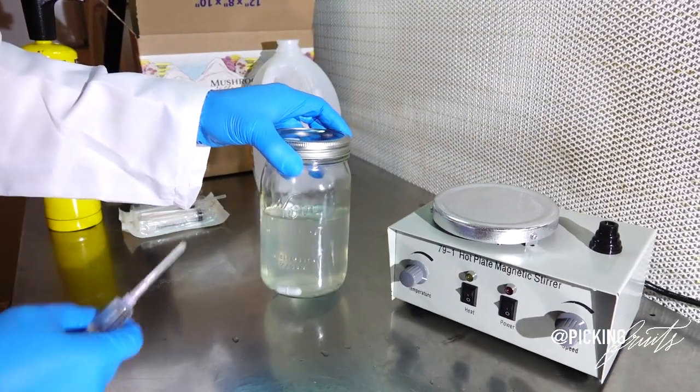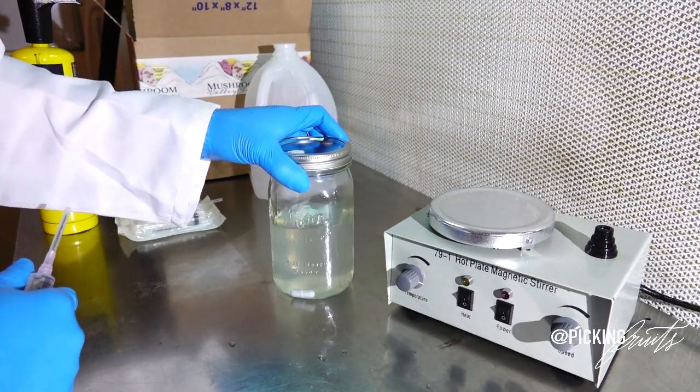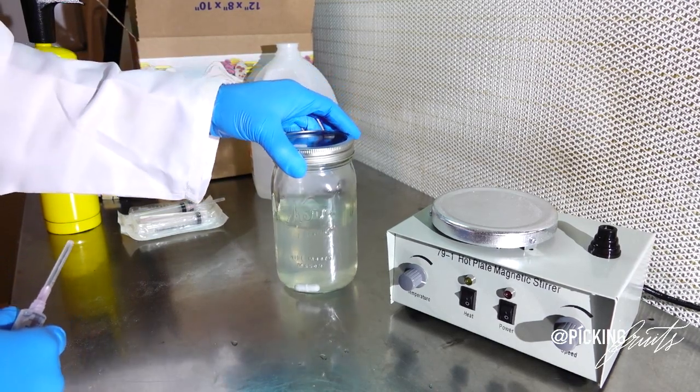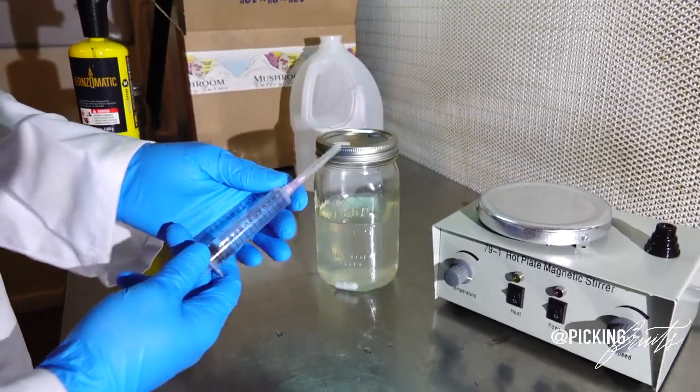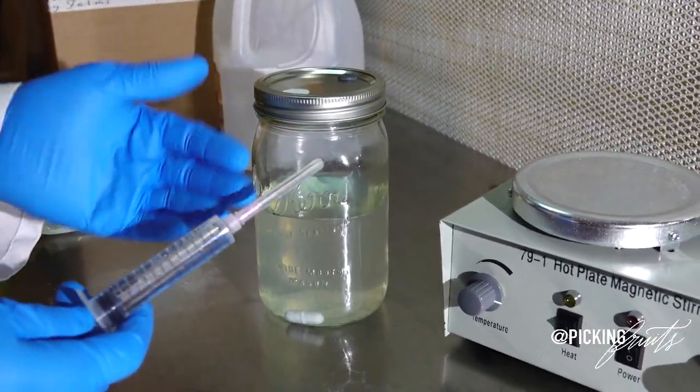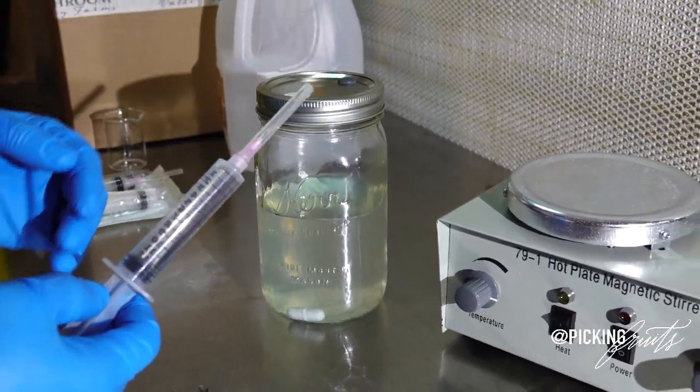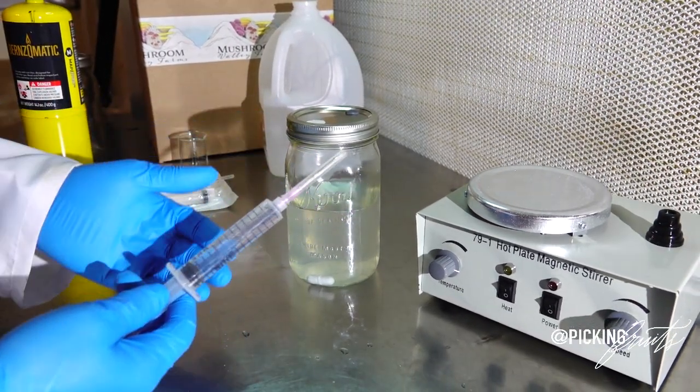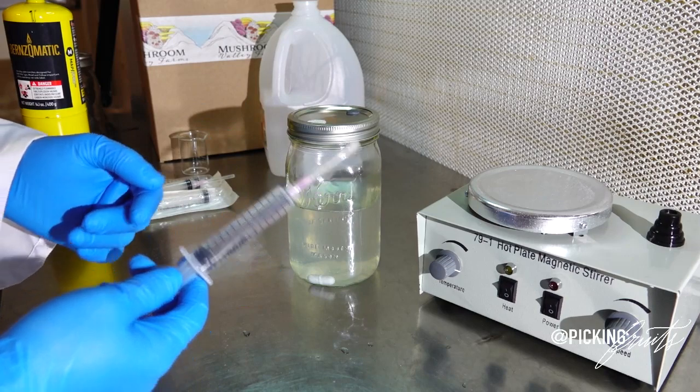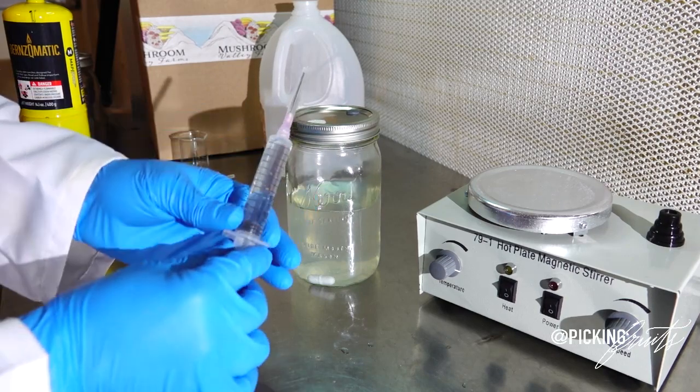So the next thing I'm going to do is I'm going to show you how to inoculate your liquid culture. So let's pretend that this already came out of the autoclave and it's cool to the touch. You're going to need to have an inoculant. You can find liquid cultures or spores from various vendors all over the internet. You can also visit our website at pickingfruits.com and you can find a nice variety of inoculants there. In this case, I'm only using water.